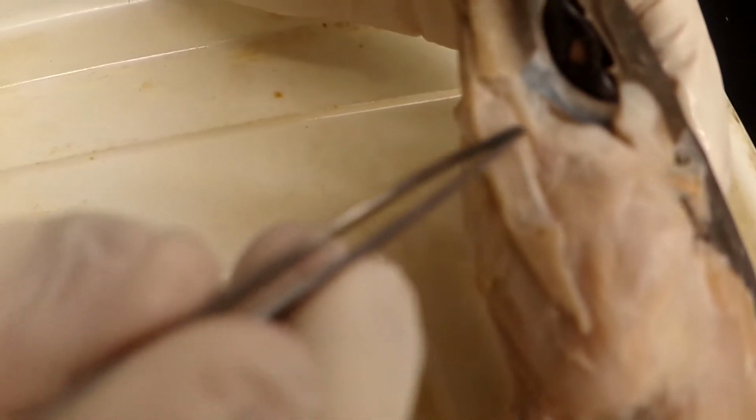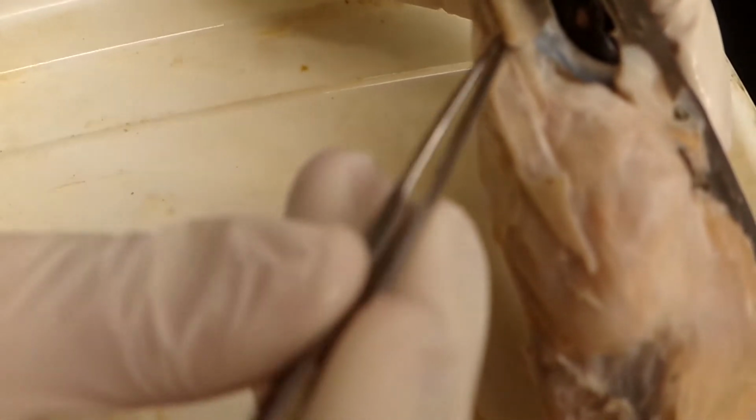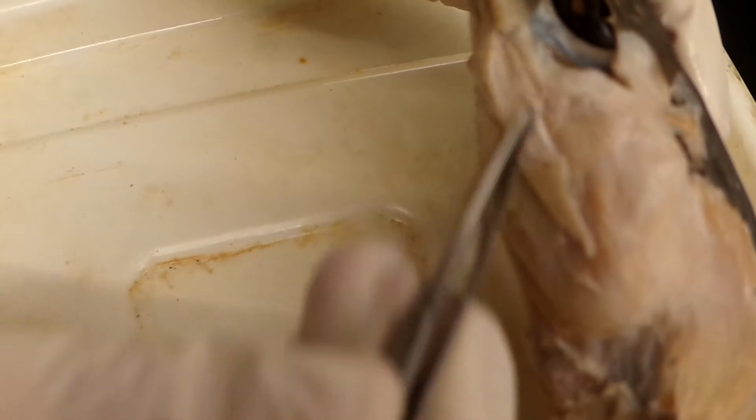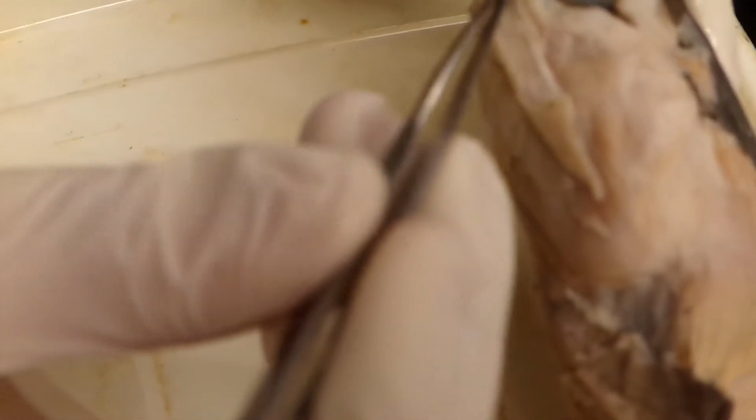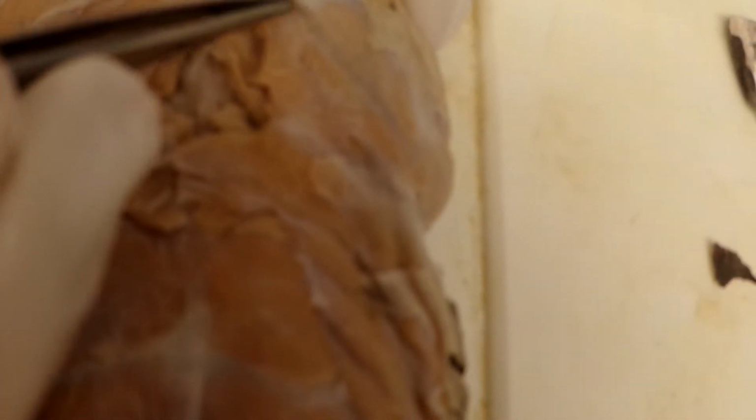And we have preorbitals, which are located below the eye, although they can't be seen clearly here, and they originate at the ventral chondrocranium and insert at Meckel's cartilage, and are also homologous to the adductor mandibulae anterior and externus.